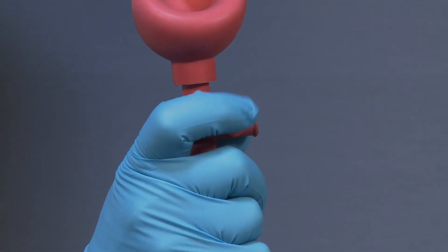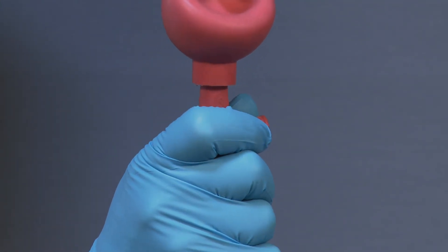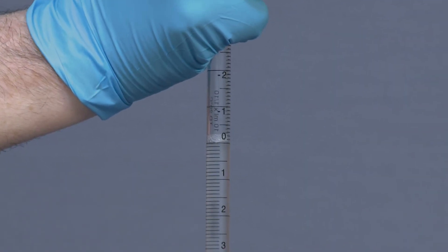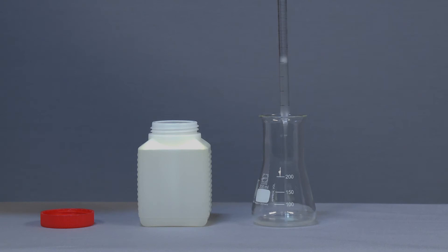Use valve E to drain the solution in a controlled way until the mark indicated in the product datasheet is reached. Empty the solution in the Erlenmeyer flask by pressing valve E.